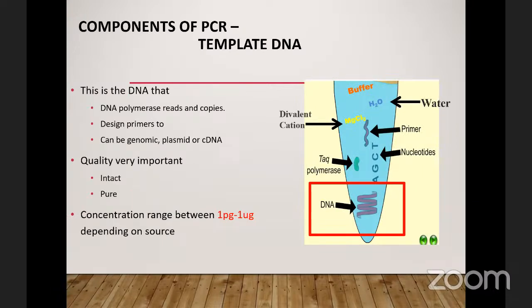Okay, so this is just explaining all of the components, one after the other. Component of PCR master mix: template DNA. The template DNA is that DNA that you extracted, right? The one you have extracted and purified that will be inside. So it's like your sample that you are setting up, right?